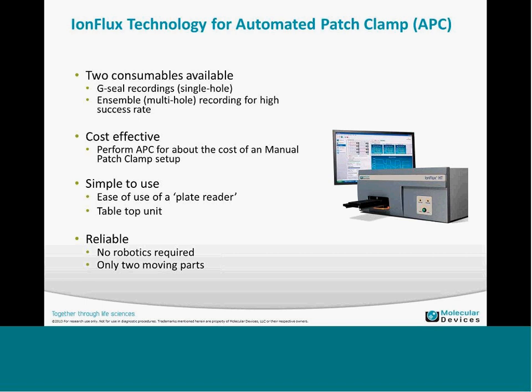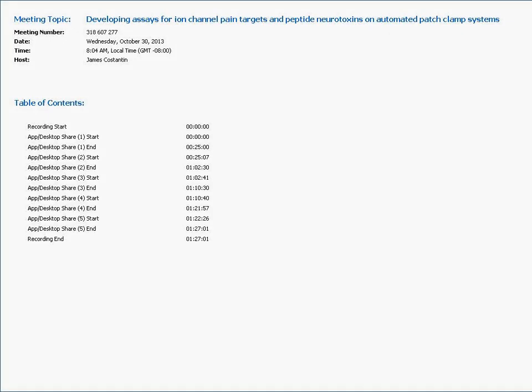Okay, then just functionally, I mentioned that compounds can be added in C1 through C8, and that's shown in the colored wells here. And basically, the other two are for the trapping of the cells and the inflow and the outflow. So I'll show a quick movie of that here, and this shows from the plate view down into a map view of the experimental plan, and the compounds coming in on the left here, and then the cells coming in and being trapped at those two traps that you just saw the movie of. And this is just showing the cells coming in.